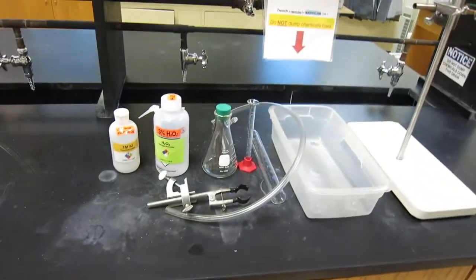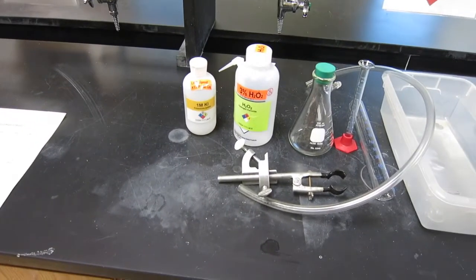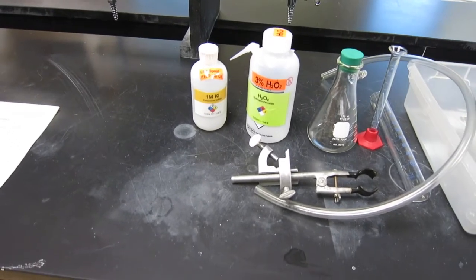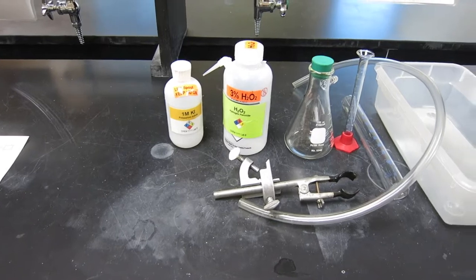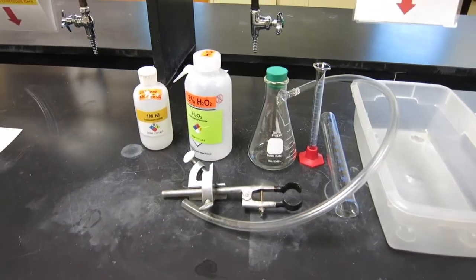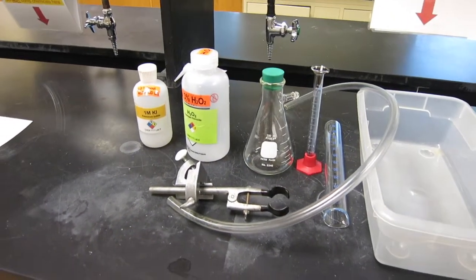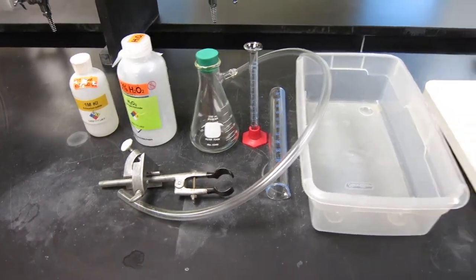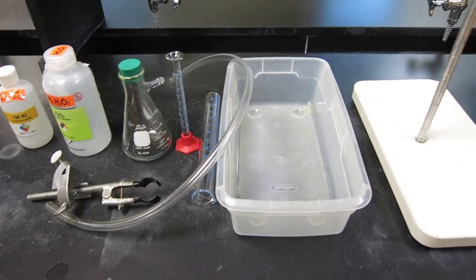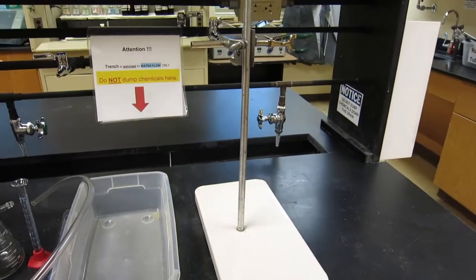This is what the material we need. We need one molar KI, potassium iodide, 3% hydrogen peroxide, side arm flask, graduated cylinder, and a container. And we need a stand with the clamp.